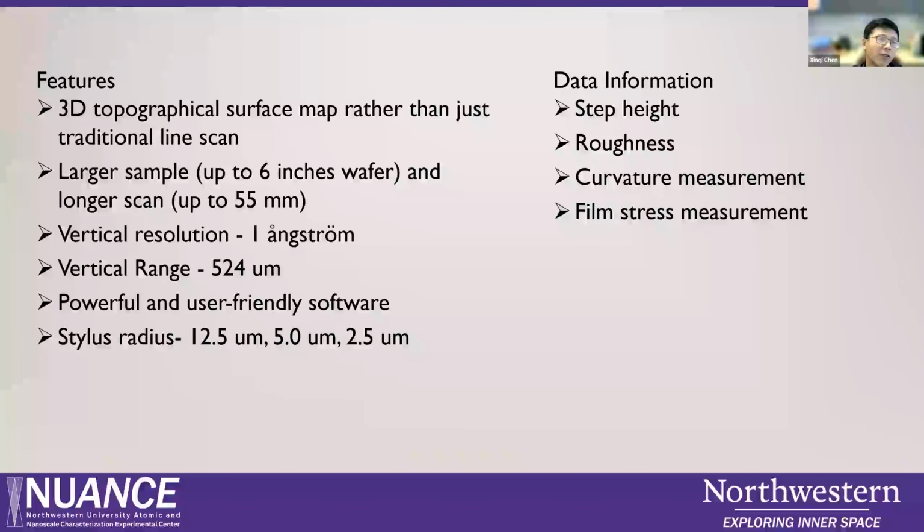slide is a summary for the stylus profilometer. They can do 3D topography, and of course traditionally the line scan is commonly used. The advantage is a very large area. They can even use stitching, going to a 6-inch wafer. And for vertical resolution, they claim they can do 1 angstrom if your sample is smooth enough.